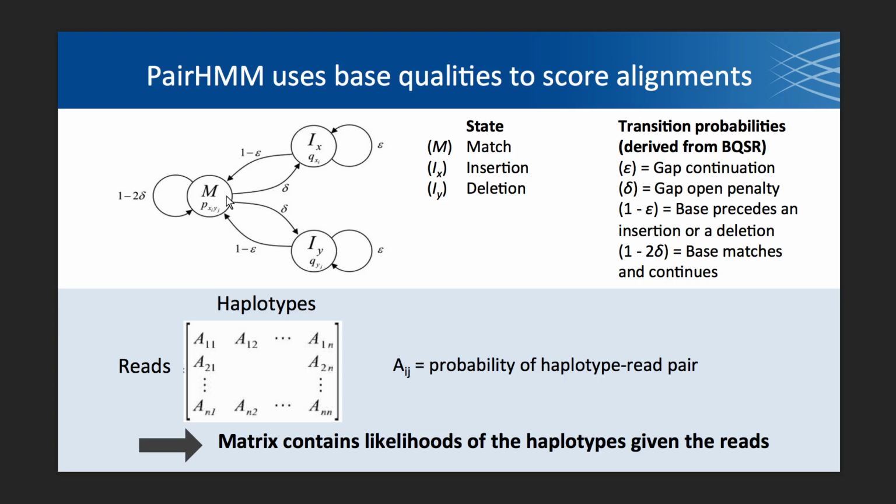What we want to do is align two sequences to each other and allow for one or the other sequence to have extra bases with respect to the other. So in the case of the reference having extra bases, that would be a deletion in the read. In the case of the read having extra bases, that's a typical insertion. And so as we iterate through positions looking at each one of these sequences, it's going to be in one of three states. Either they're going to match each other, which here we're not requiring that the bases have to be identical. Like we could still have a SNP in the match state. We're just saying that neither one of them has an insertion with respect to the other.